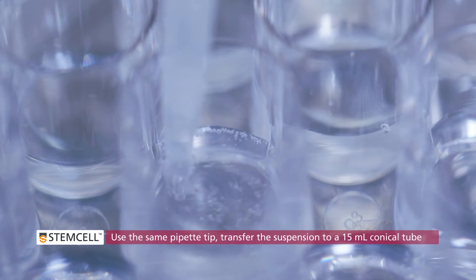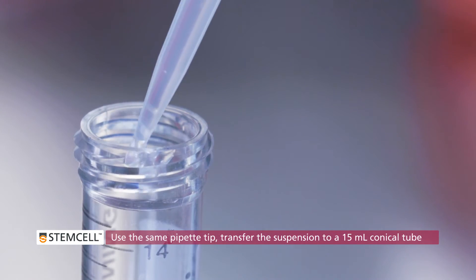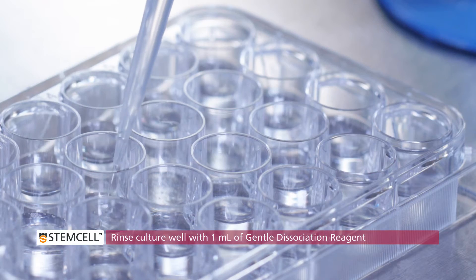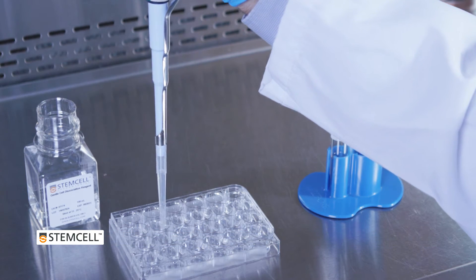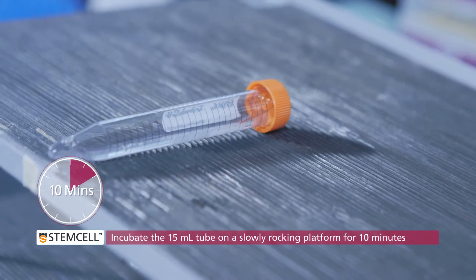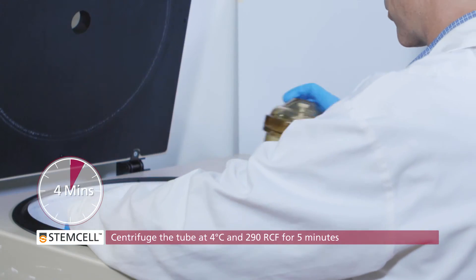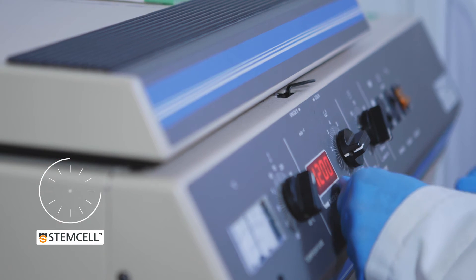Using the same pipette tip, transfer the suspension to a 15 milliliter conical tube. Rinse the culture well with an additional 1 milliliter of gentle cell dissociation reagent and add this to the tube. Incubate the 15 milliliter tube on a slowly rocking platform for 10 minutes at room temperature.